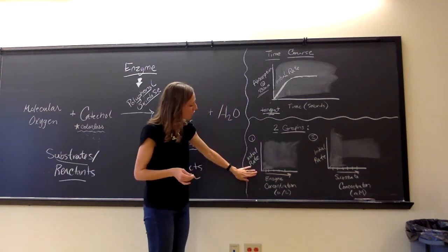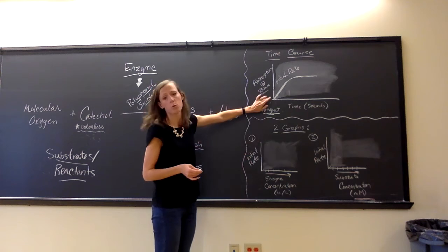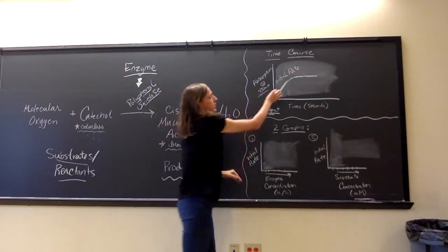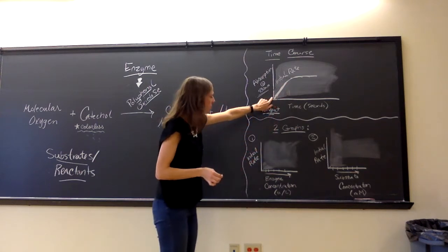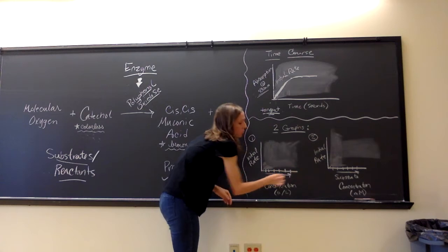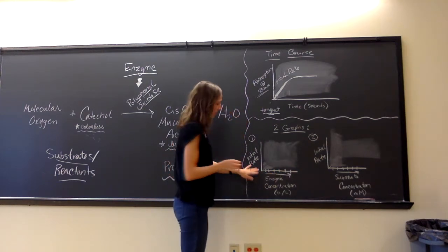And then you will plot that against the initial rate for each of those time courses that you recorded. Okay, so you will record the initial rate from each of the time courses, and you will plot those against the amount of enzyme that you used. And that would just be with a single substrate concentration.